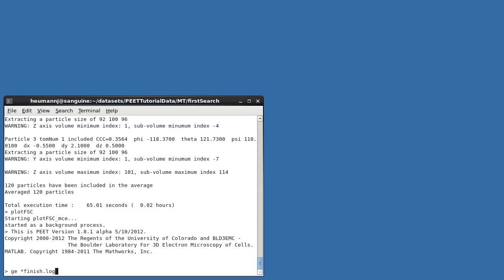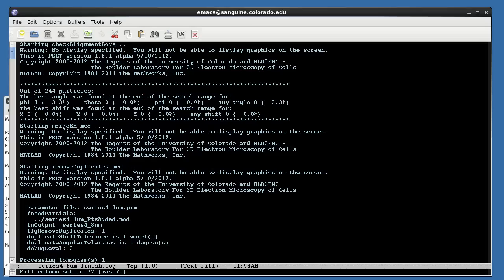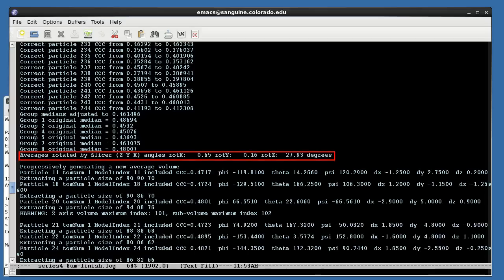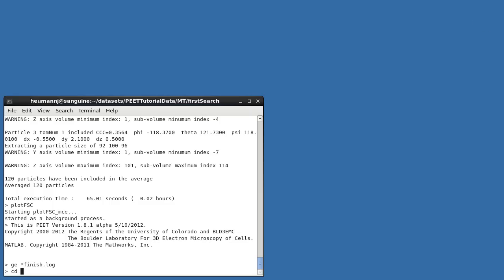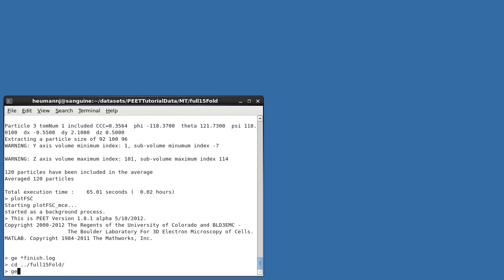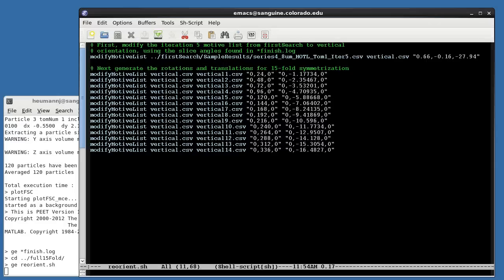The necessary angles are listed in the finish.log file, so I'll open this file in a text editor, and we'll search for the word slicer, which will take me to a line containing the required angles. Making note of these, let's go up to directory full_15fold, where we'll do the symmetrization, and where I've created a shell script, reorient.sh, to perform the necessary operations.